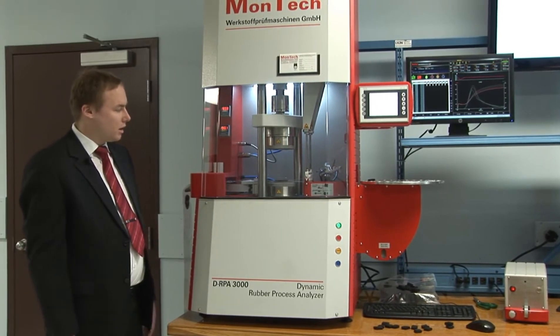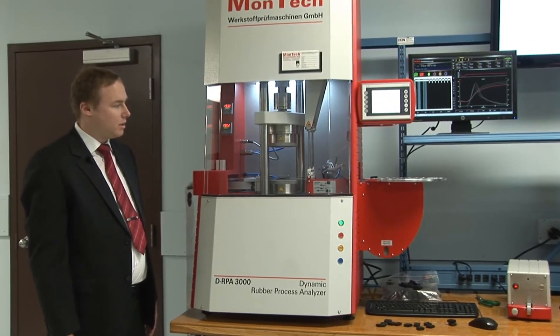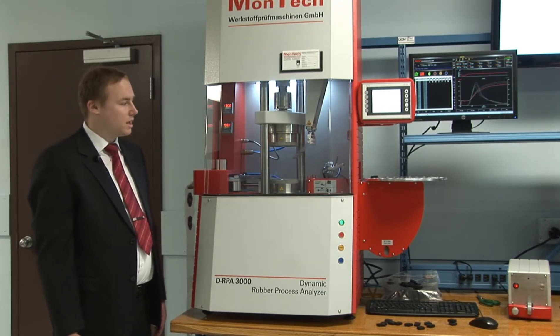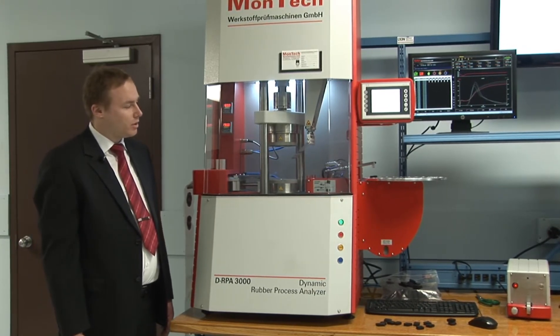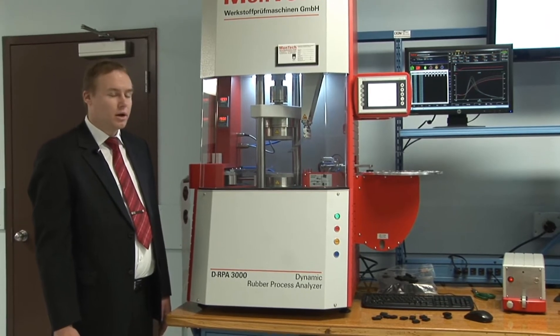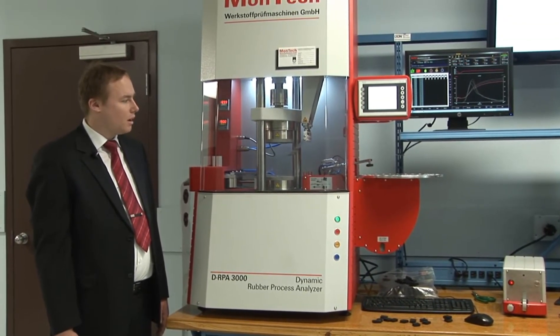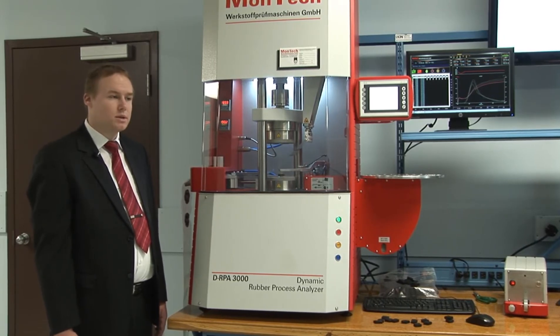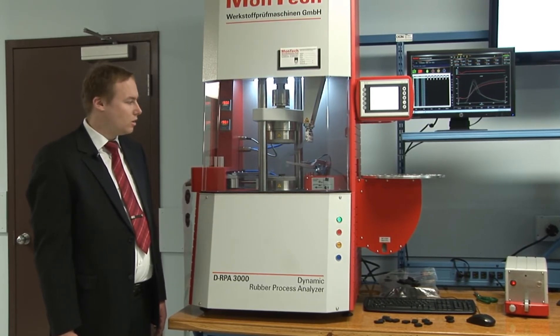Here we can see the first tested sample removed from the die, the second sample is picked up from the tray and directly placed onto the die, and afterwards the test sequence starts automatically.